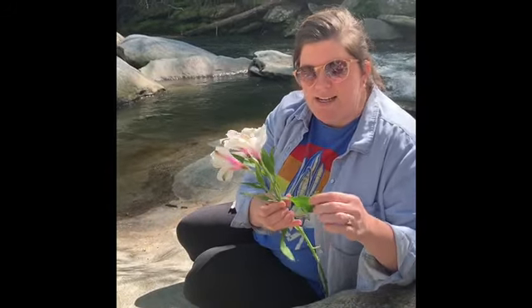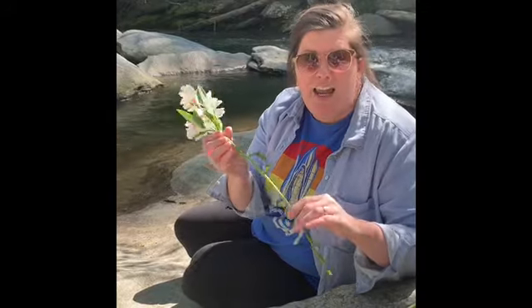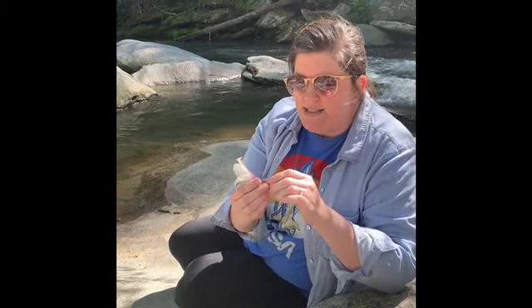Alright, so of course these are the leaves, and this is the stem, which leads to the roots, and that's where the flowers get their nutrients from. But if I actually take the individual bloom off, what parts do I have? Alright, well, these outside pieces, and it's kind of hard to see.